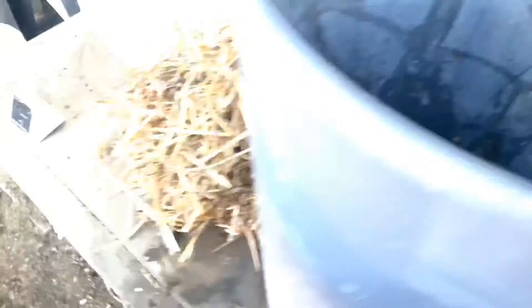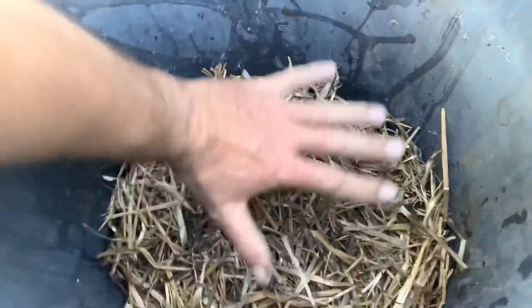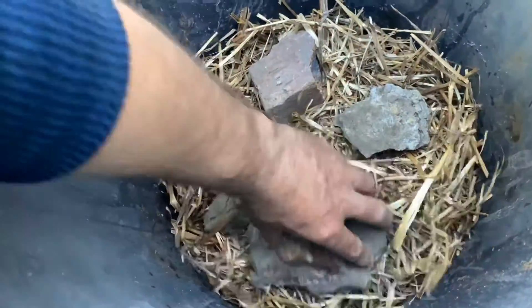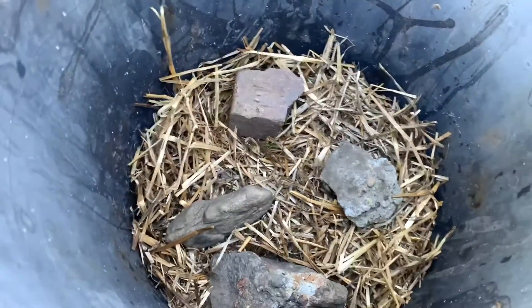The next step is to put hay on top of the river stone. You're going to want to put a couple of bricks on top of that to stop the hay from floating up when you fill it up with water. I've come across a few rocks I'm going to put on top instead of bricks, along with a piece of broken brick as well. It should be enough to hold the majority of it down as we fill it up full of water.